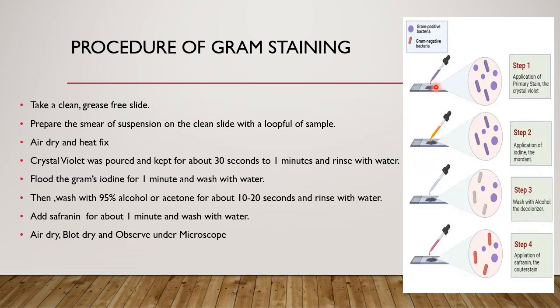Make sure that it completely covers the smear. Then you will leave it for 30 seconds to 1 minute so that the bacteria take in the purple stain. After that, you will wash it with water, just slightly under running tap water.